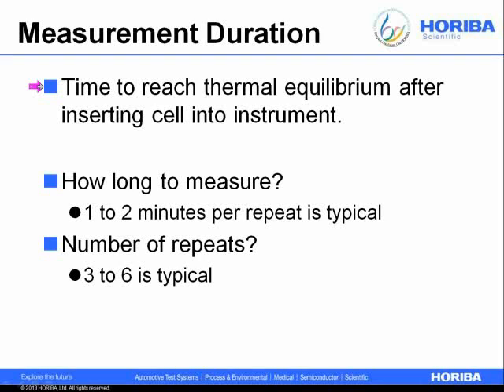And that's because Brownian motion is dependent on temperature and, more importantly, viscosity, where viscosity is a stiff function of temperature. One way to make sure that this process is quick, and generally the best way, is to set your instrument temperature to match your laboratory or your sample temperature.